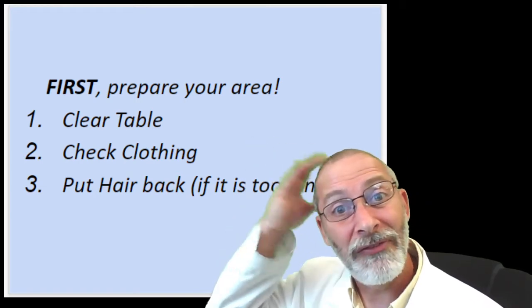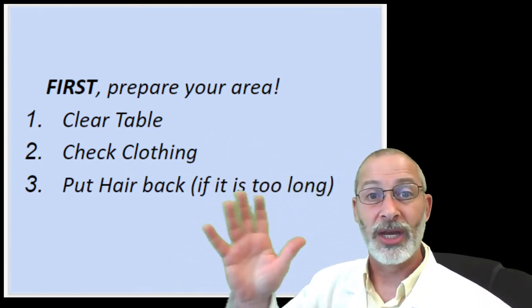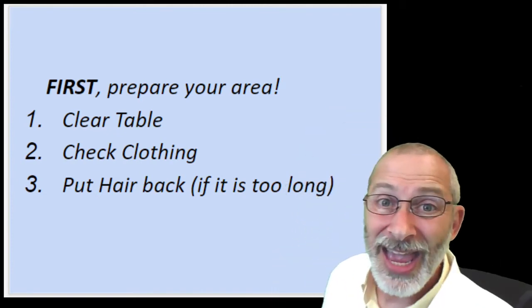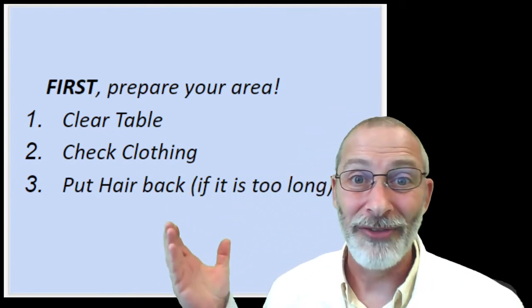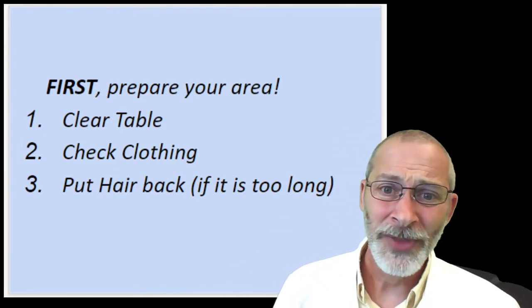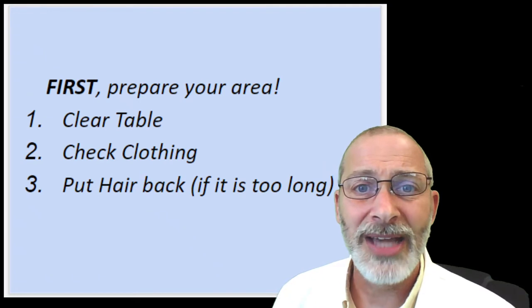It'll burn it right off and you'll have hair that looks like mine. No, just kidding. But if you've done that, you know how bad it stinks and you know that it's going to burn your hair right off. Even more so with a Bunsen burner, ladies and gentlemen. So if you've got long hair, you've got to tie it back.